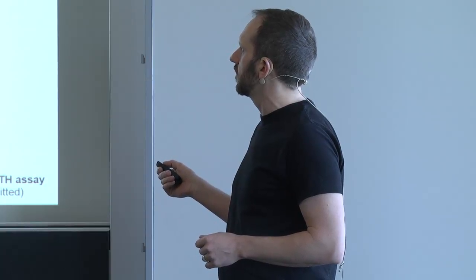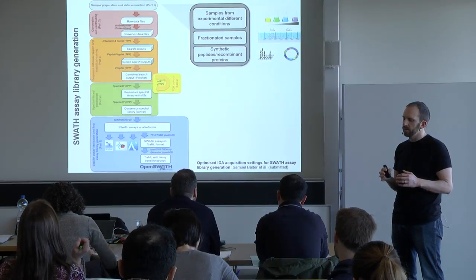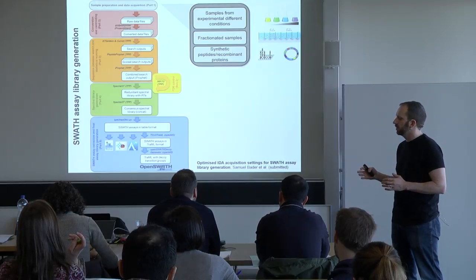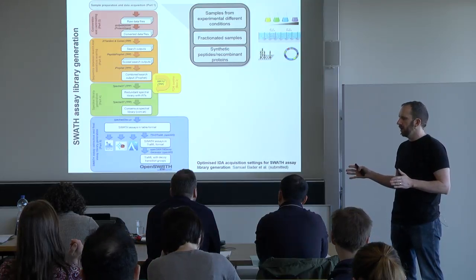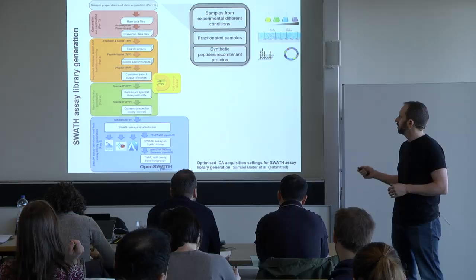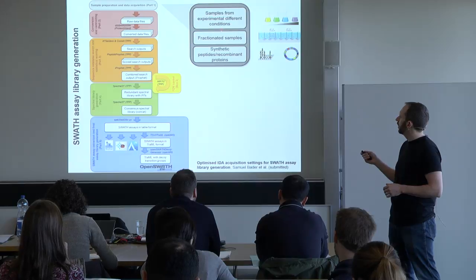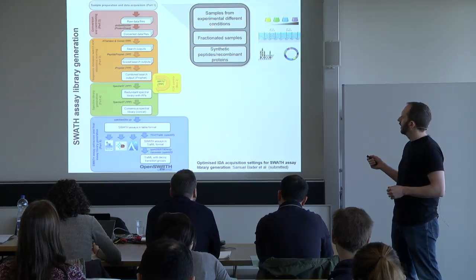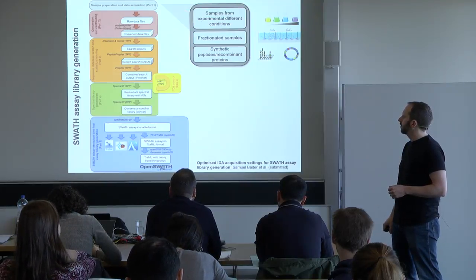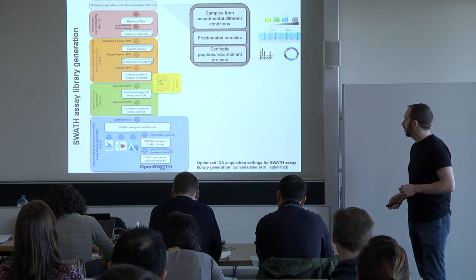I think recombinant proteins is a great way to do it, but it's hard to do at large scale. So there's a paper from the McCaw lab saying you can use in vitro transcription translation systems to express the protein, and then you just digest it and put it in the mass spectrometer, and that way you get information basically about all the peptides that are detectable from the protein, whereas you might not get that from synthetic peptides. And when the samples are so-called real biological samples, what you'll get is hopefully the best peptides, but that's not necessarily always the case. So this recombinant protein idea, I think, is quite nice.